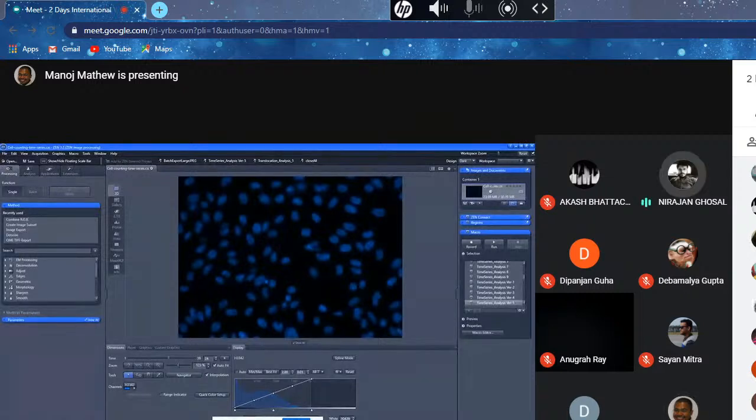I have measured, I have referred to these two different endpoint images. If I am taking an image at the onset of my experiment, and after like 24 hours or 12 hours I have another image, where the cells are overlapping or not, can these two different time point images be used in this scratch assay module?